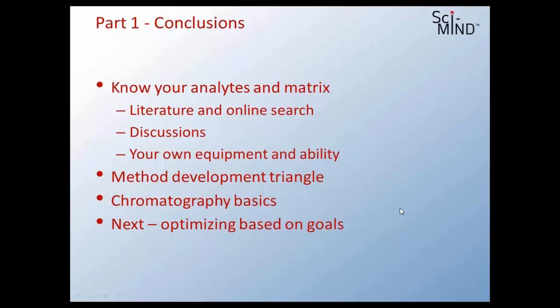They're also kind of similar because you're still doing the same things. Even if you're optimizing somebody else's method or a method that's already been developed, you still want to go back and think about what the state of the art is. Maybe somebody else has already invented that wheel and you don't have to reinvent it. If you're developing from scratch, of course, we go to the literature and see what we can find there. So the approaches aren't that much different because we still need to do our homework up front, before we get to the instrumentation.